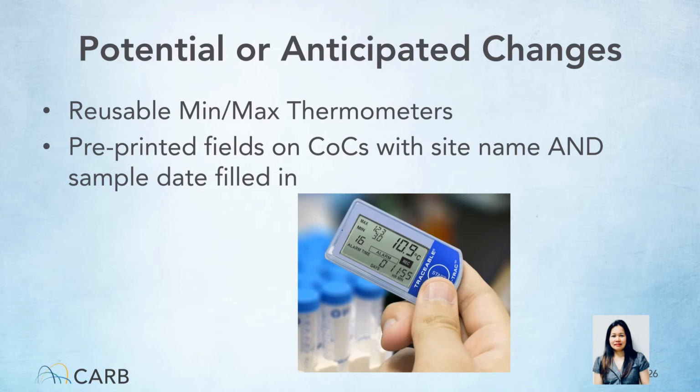We mentioned in the beginning of the presentation that we are almost finished with logging sampling media into our LIMS database before the media goes out to the field. This has allowed us to fill in certain portions of the reports before the reports are printed, like the site name. This is already occurring for most programs.